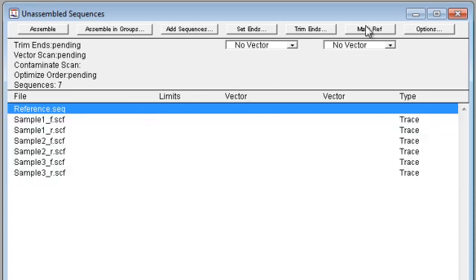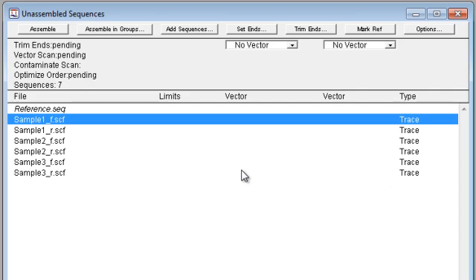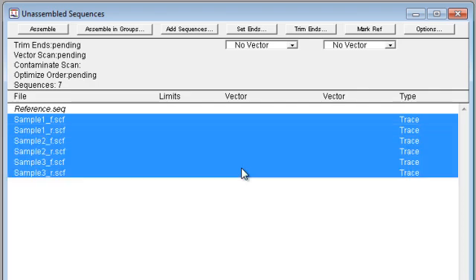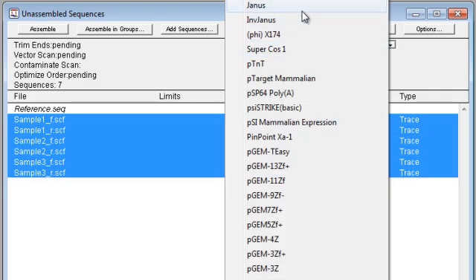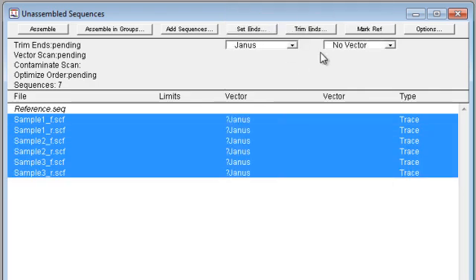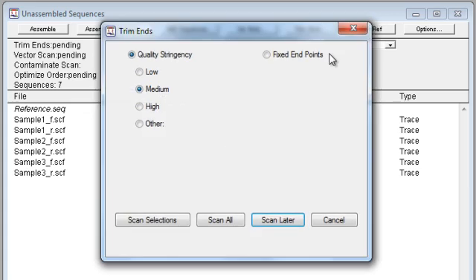Then use the MarkRef button to designate the reference sequence. Here you can also specify a vector sequence to trim and adjust quality trimming options.